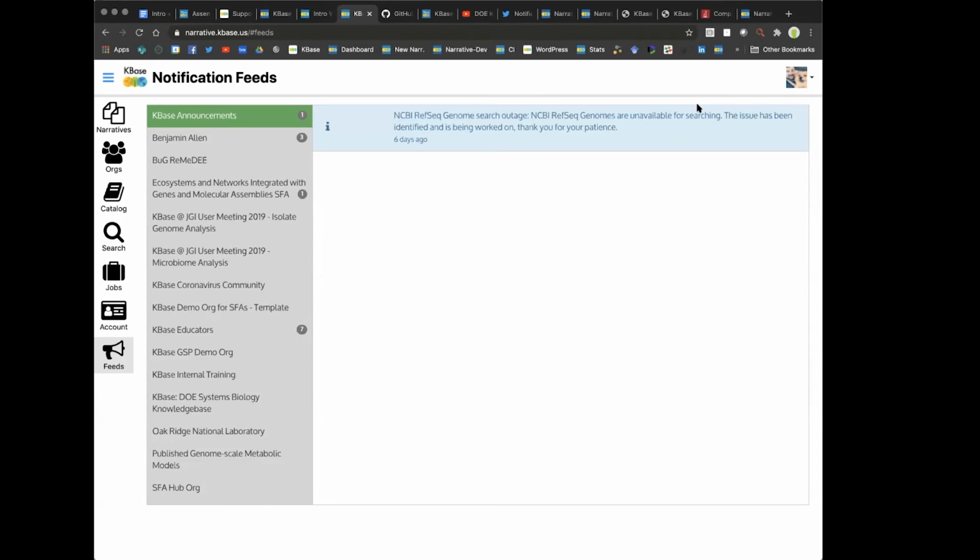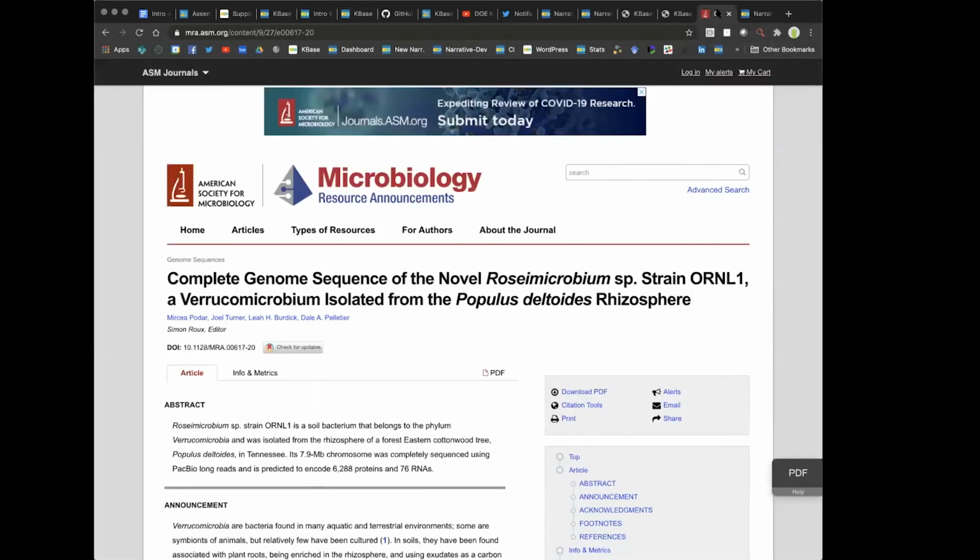We've got some recordings of webinars that we've done in the past on those types of analysis workflow tutorials. We didn't do much of that today, but hopefully you got a greater sense of what KBase is, the various parts of the system, and the features. But I just wanted to show some examples of how our users are putting the system to use.